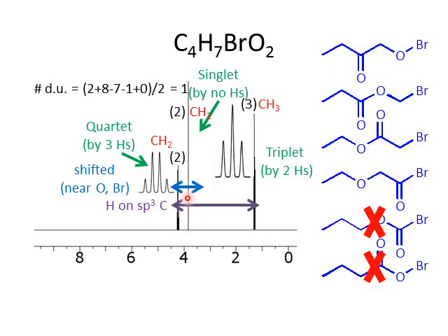Now this is where we start getting into a little bit of judgment calls, because remember I said I don't want you to learn a whole bunch of specific numbers. I'd rather you learn trends. But if things are at the far left side of this region, they're probably directly next to something electronegative. So that's going to allow us to cancel out those top 2 cases.